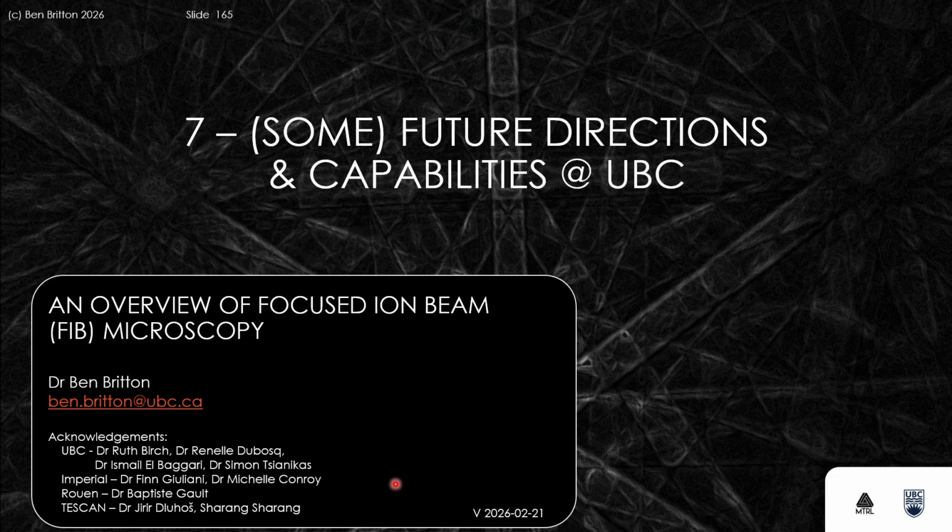So that's going to move us into our last lecture, where we're going to look at some future directions for FIB-SEM approaches. And I'm also going to give just a brief outline of some capabilities at the University of British Columbia that may be useful for some of our audience.